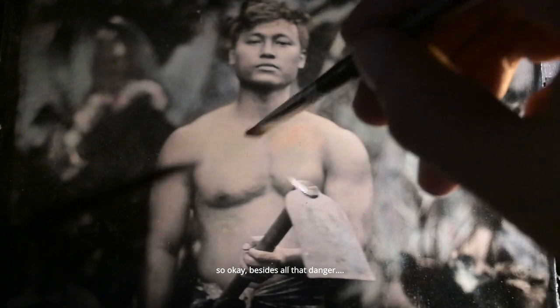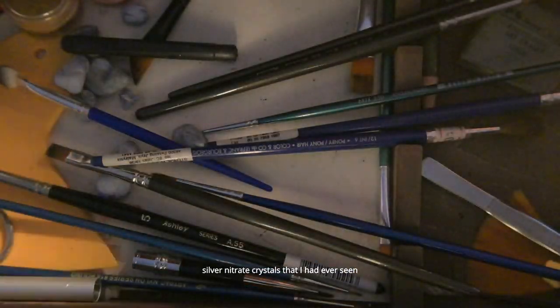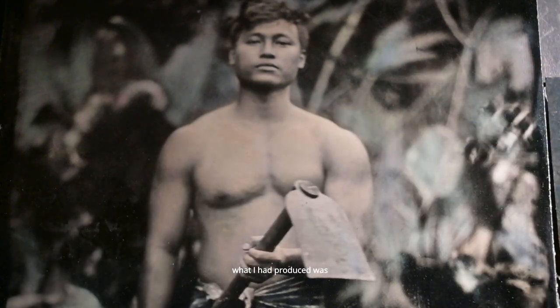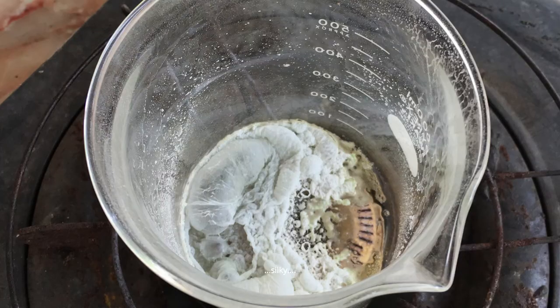Besides all the dangers, what was interesting was that his method had produced one of the most beautiful silver nitrate crystals I had ever seen. Usually in the past when I was doing this in the lab, what I had produced was clumps of crystals — pretty much like salt, large clumpy salts. But for his, that was different. It was silky, like a spiderweb. I wasn't seeing anything like that.